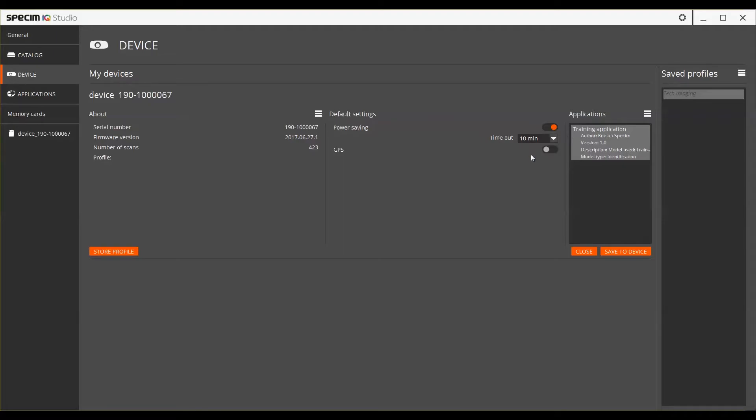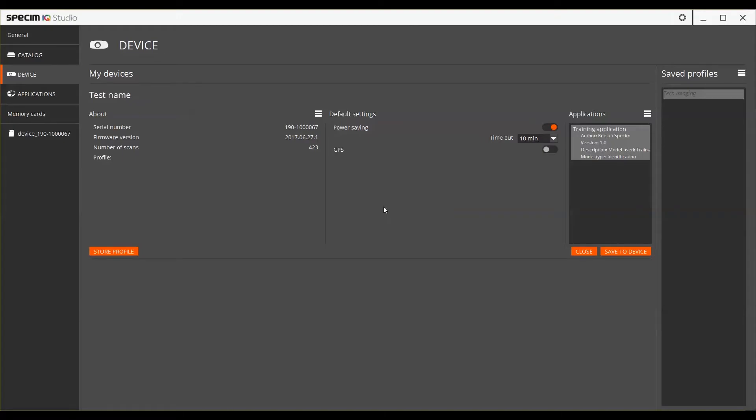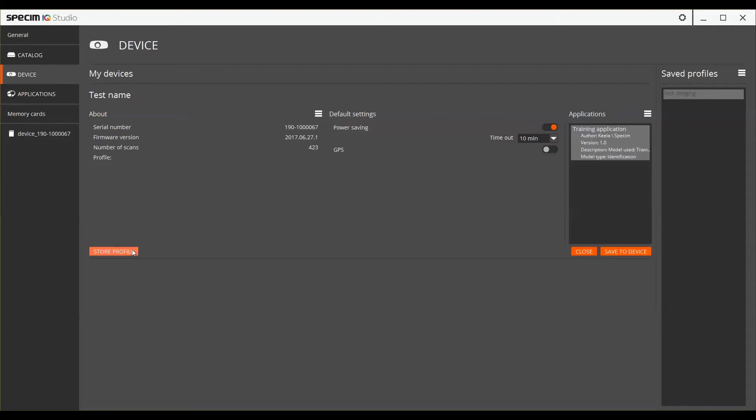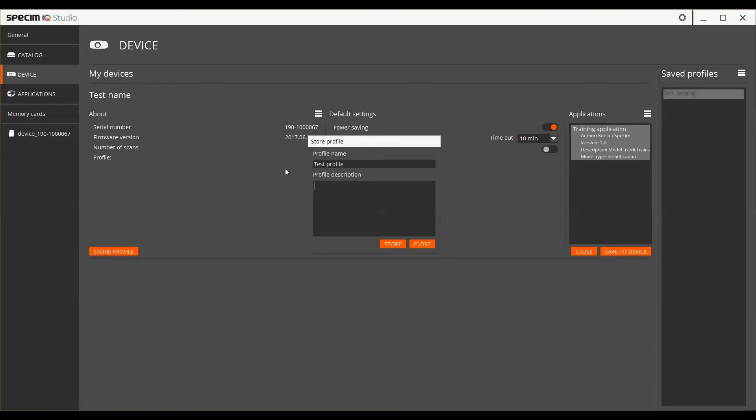You can also change the settings for the device name and the author information. The device settings and applications together create a profile, which can be saved from the Store Profile button. Name the profile and give it a description. Once you've given the profile a name and a description, press Store.